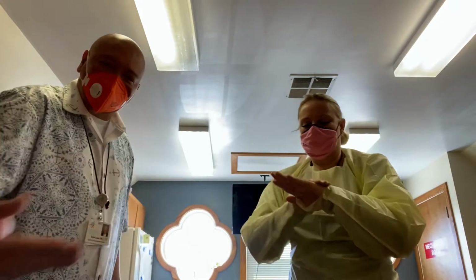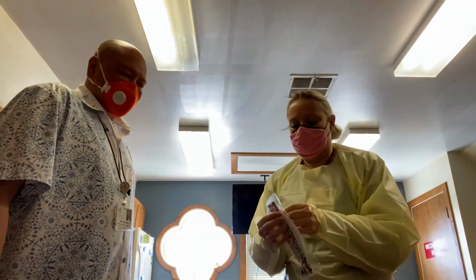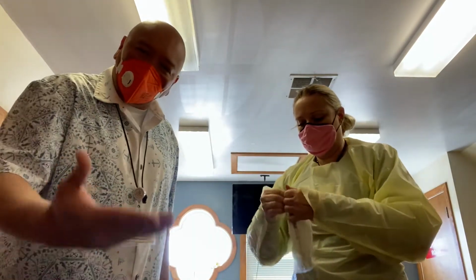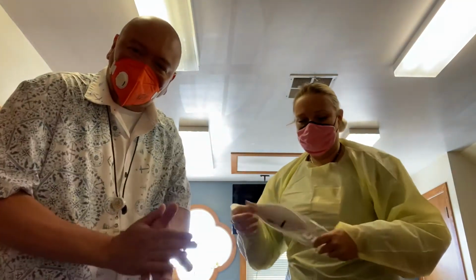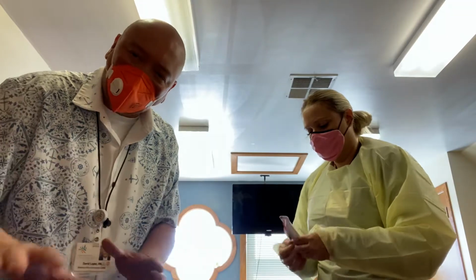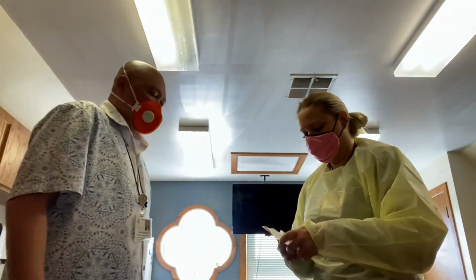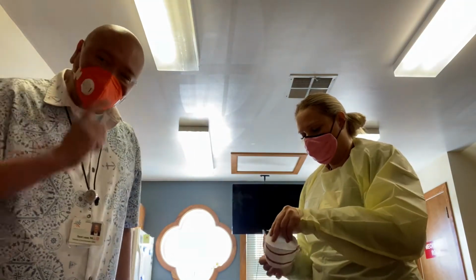Sanitize again, and sanitize every step of the way. Now you'll see through the video that we will be doing a lot of hand sanitizing because when you touch surfaces as you go and test patients, you need to ensure that you have alcohol-based hand sanitizers every time. So here now she's putting on her N95 mask, making sure that it fits her properly.